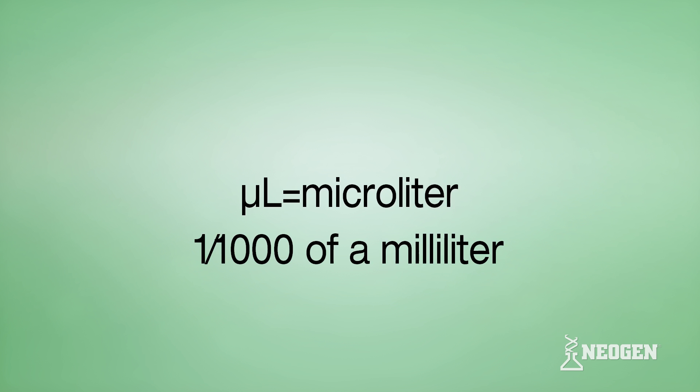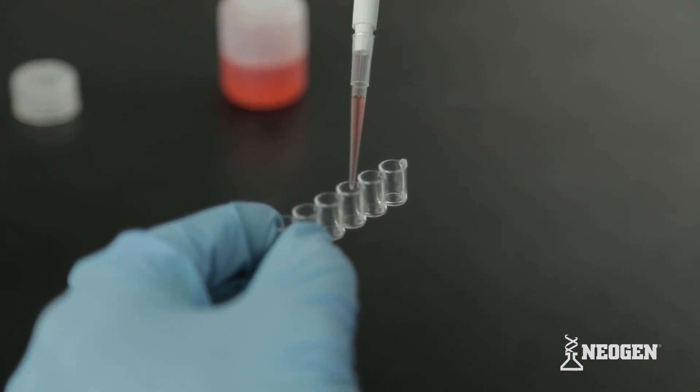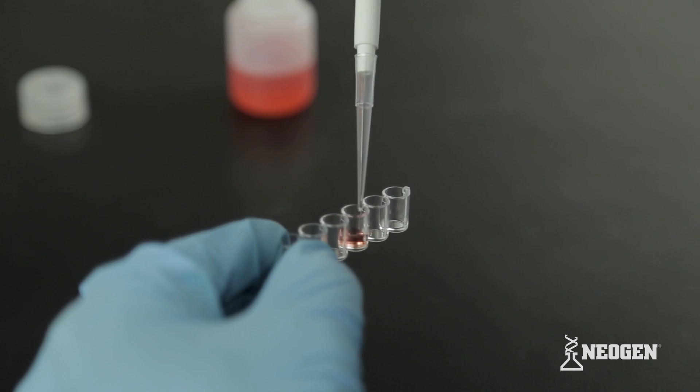The microliter symbol refers to one one-thousandth of a milliliter. Because the volumes are so small, correct pipetting is essential to performing Neogen's tests correctly.